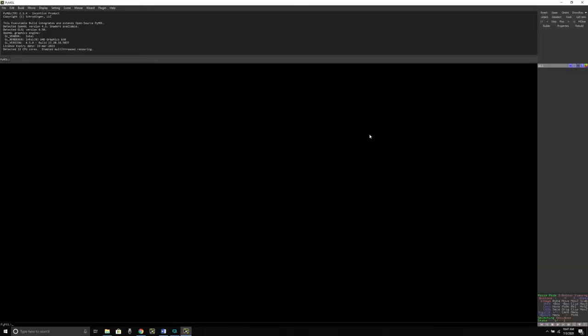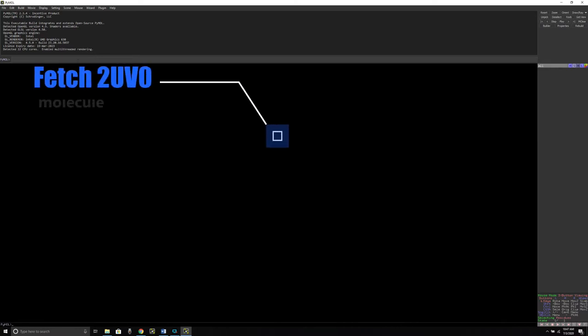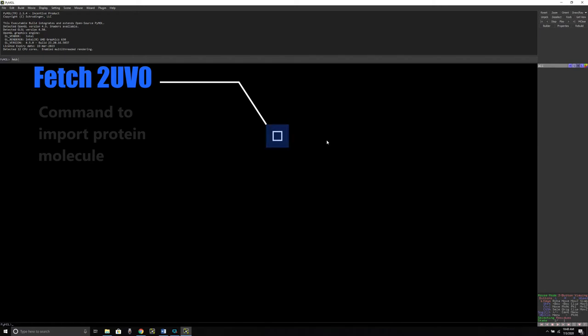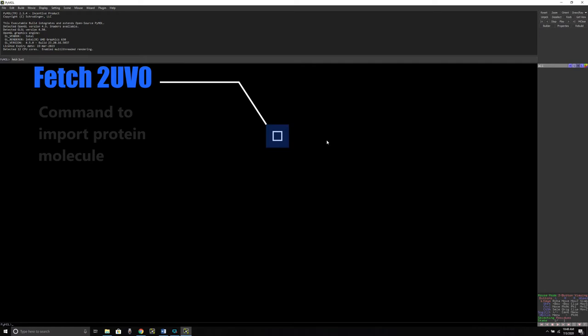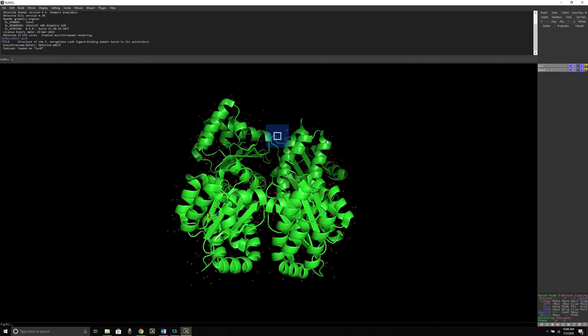To export a ligand molecule from a protein structure, we need a protein structure and for that we need to use a command called fetch command. We are going to go to the command line and type F E T C H space. Now you need to type the four letter code of your protein. In our case, it is 2 U V 0. So I'm going to type F E T C H space 2 U V 0 and press enter.